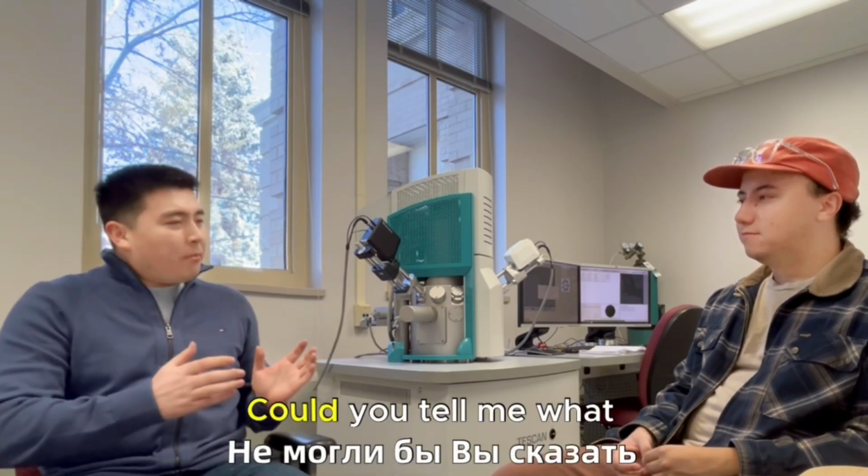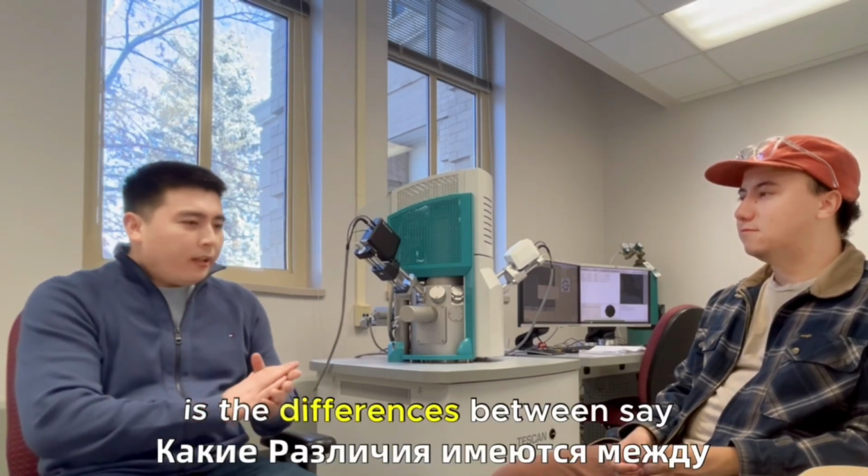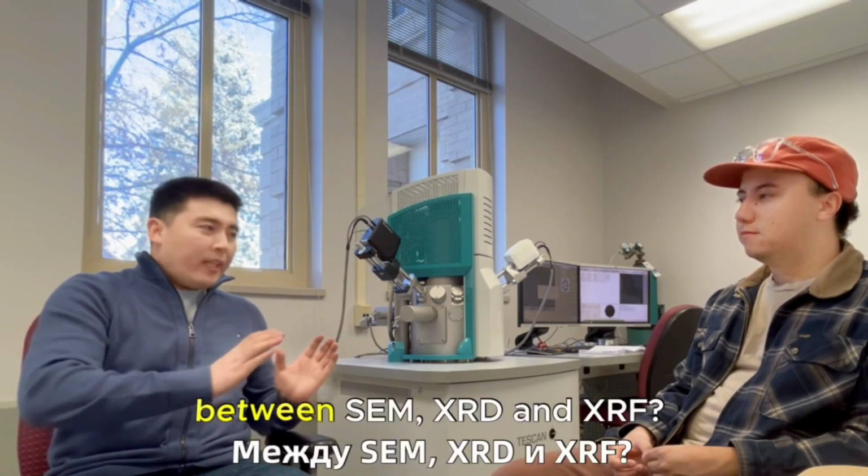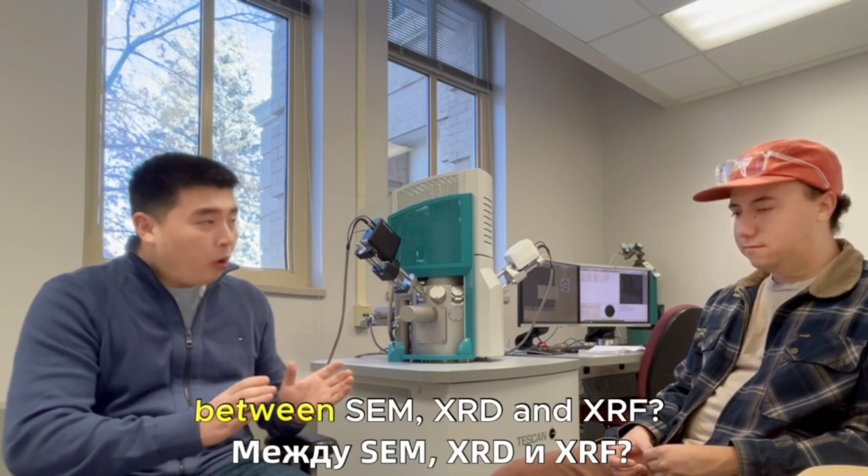Totally. So could you tell me what the differences are between, say, working principles? Let's start with the overall differences between SEM and XRD or XRF.